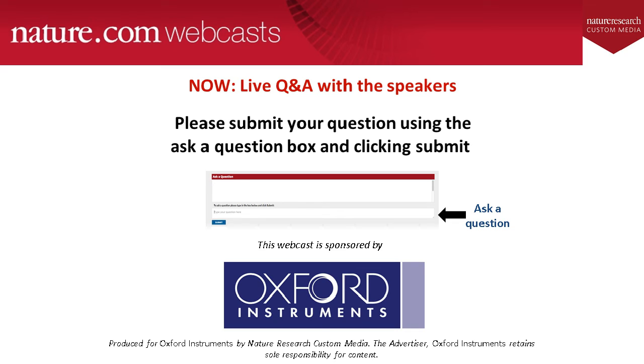Excellent. Thanks, Louise. Our next question was wondering if you can just confirm what the optimal working distance for the Extreme was. The optimal working distance is generally set when the Extreme detector is installed.